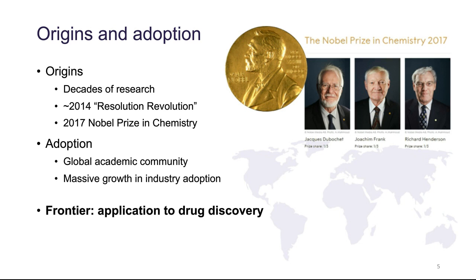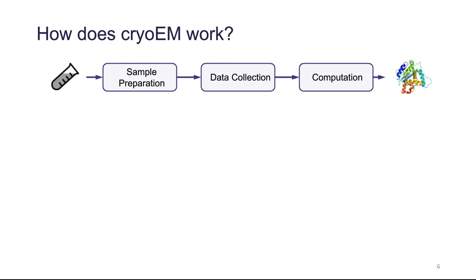There are three main phases in a CryoEM project: preparing a sample, imaging the sample in 2 dimensions, and computationally curating, sorting, reconstructing, and recovering high-resolution 3D information about the target from the raw image data. The computational recovery of structural information and how it can be useful for drug discovery is the focus of today's webinar, but it is critical to understand the sample preparation and imaging phases which give rise to the challenges that must be overcome computationally.